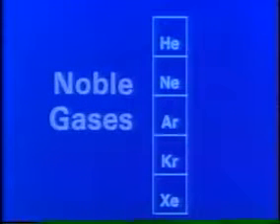We now let the inert gases, unreactive so far, into the 5 reaction tubes containing the phosphorus. The phosphorus is heated until it actually boils. The solid you see on the walls is not from a chemical reaction. It is condensing phosphorus. Again, the 5 gases are unreactive. Let's group these gases together as a family of elements, the noble gases, all with similar chemical properties.